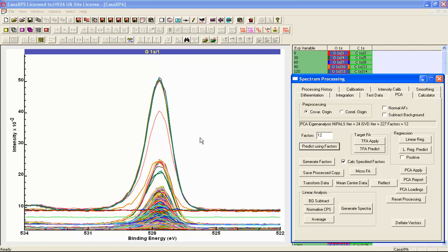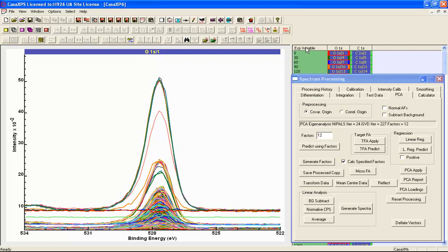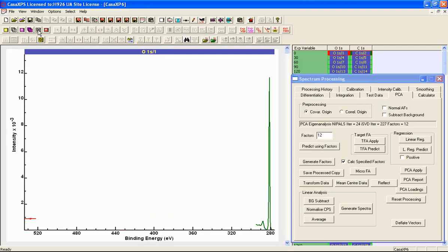and you can see that for the most part the PVP spectra have cleaned up in terms of noise, and we still have something that looks a bit like noise for the polystyrene. So I'm now happy I've got a data set that is noise reduced for both carbon and the oxygen. In the basic profile I use just the carbon. In this case I'm going to use both the oxygen and the carbon as part of the linear least squares. So I need to prepare these data so that I can then perform a linear least squares using vectors that are both oxygen and carbon.